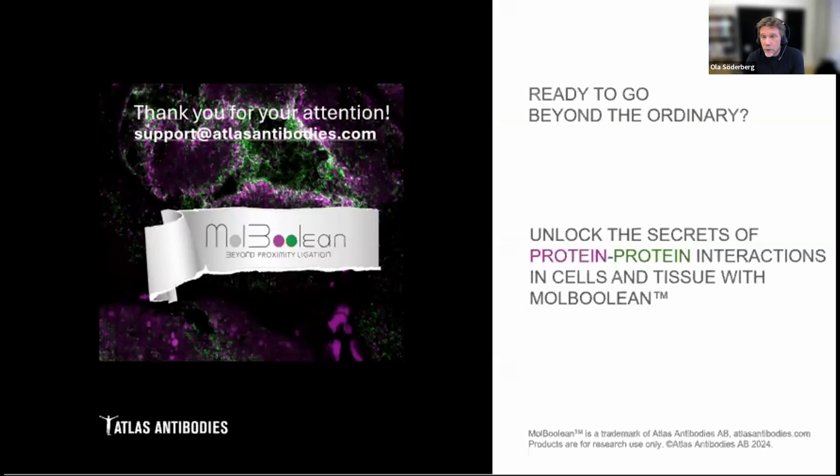For MolBoolean, it doesn't matter so much because you have a preformed circle hybridized to the oligo that you then cut and religate. So you will always come back to the circular molecule in the end. For PLA, it's more of a problem, because if you have many oligos, there will be situations where you create linear ligations even though the antibodies don't bind in close proximity. So for MolBoolean, I don't think it's a problem, but for other methods, maybe a little bit.